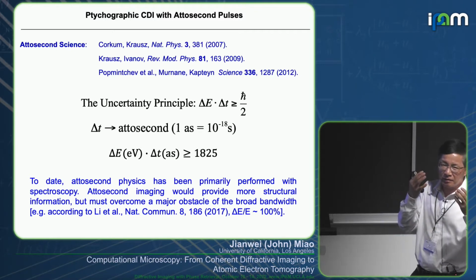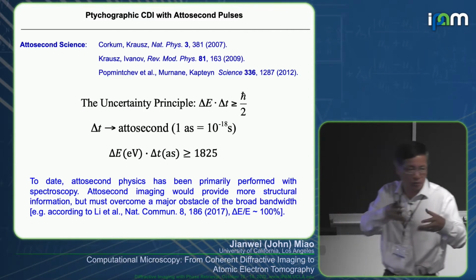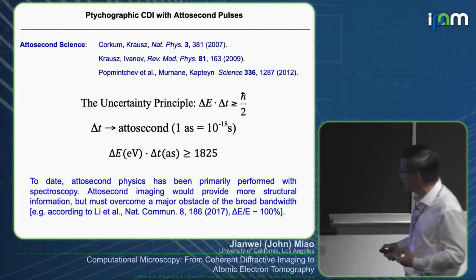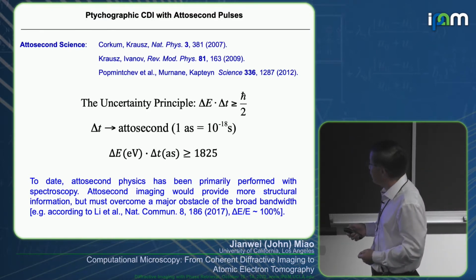And think about it, right? If you use a microscope, you usually have the sharp, one single lambda you can focus. With broadband, you get blurred, just like older eyes getting a blurred image. You want a sharp image, you need a single wavelength. So we developed an algorithm to try to disentangle this kind of information.